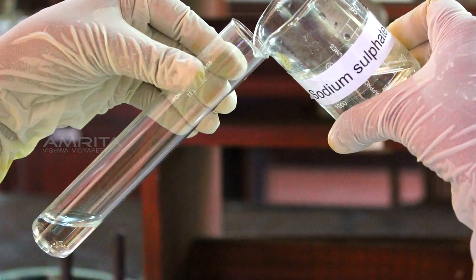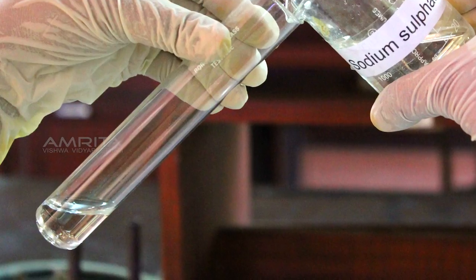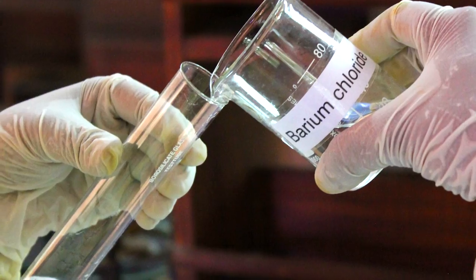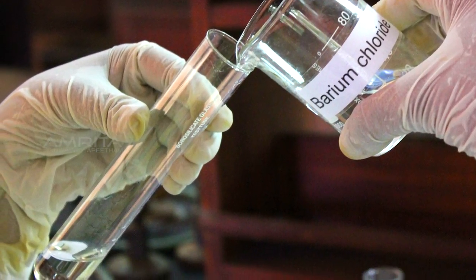Take a small quantity of sodium sulphate solution in a boiling tube. Then, take a small quantity of barium chloride solution in another boiling tube.